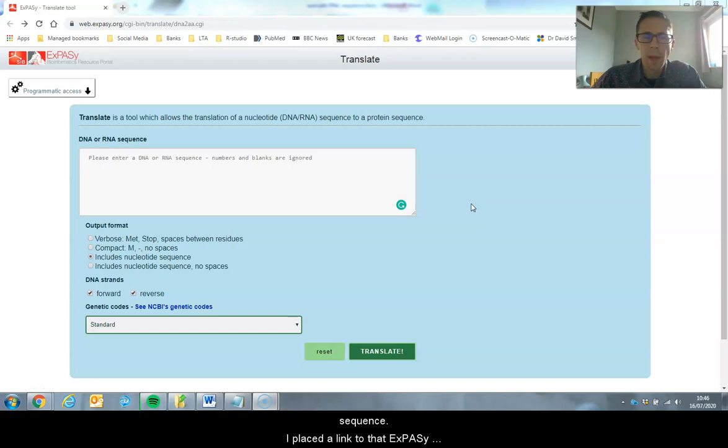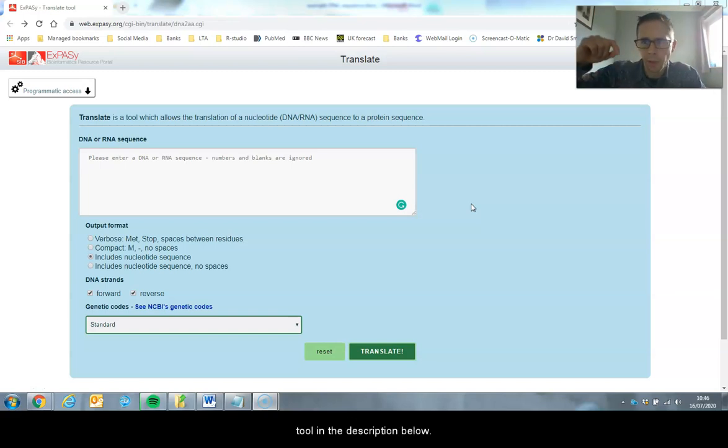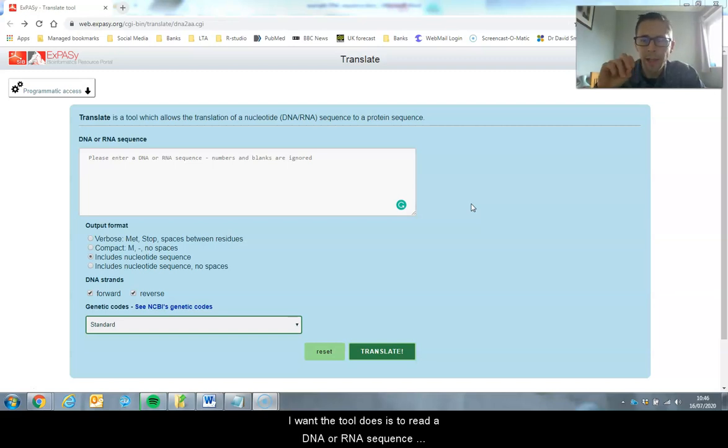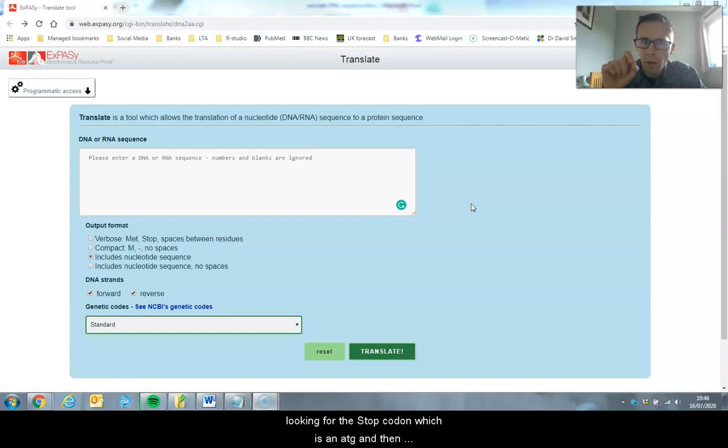I've placed a link to the EXPASY tool in the descriptions below. The tool reads a DNA or RNA sequence and looks for the start codon, which is an ATG.